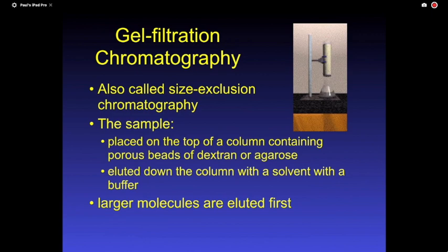What's going to happen is your protein is going to be in solution. It's got a certain shape, and it falls by inside that running buffer, so it's moving in that volume of liquid. That protein will tumble as it falls. The size is the volume of the tumbling. If your protein is globular already, as it tumbles, it doesn't change size very much.